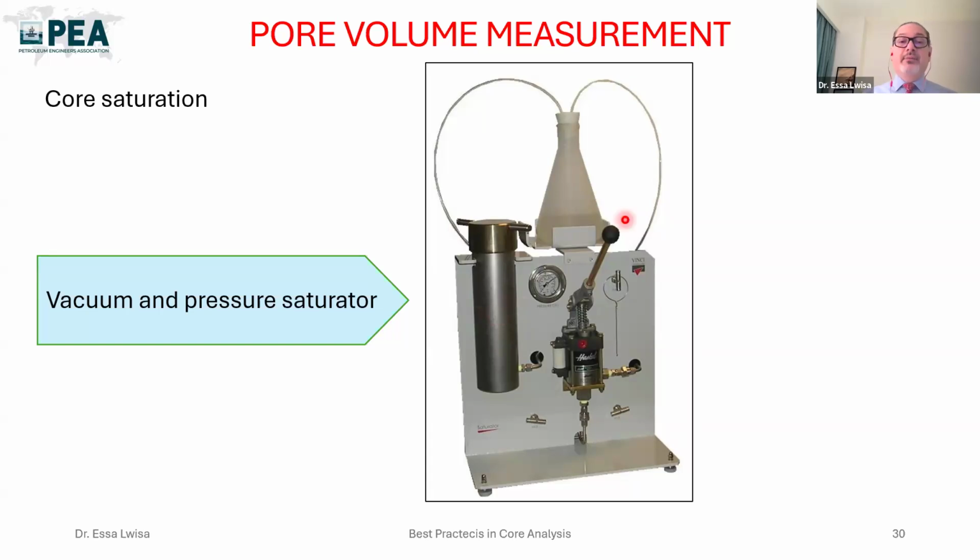After that, we apply pressure up to 2000 psi. By that, we guarantee all pores, even small pores, have been invaded by the water, formation water or distilled water, whatever your plan is. Then you keep the sample like that for another 8 hours or overnight.